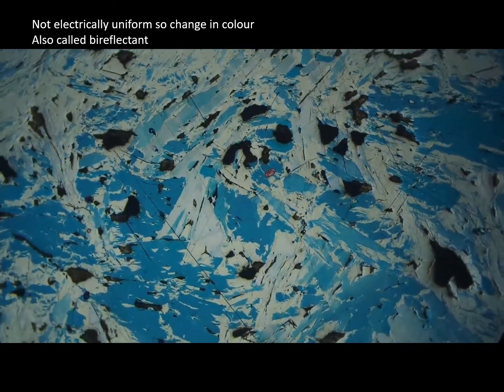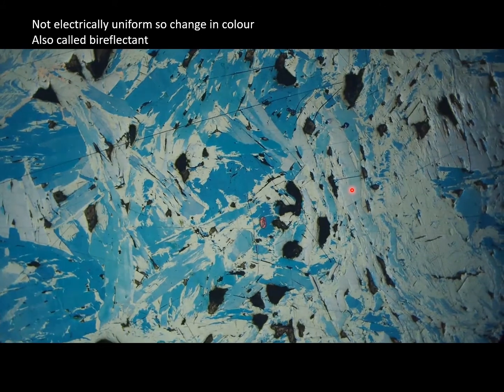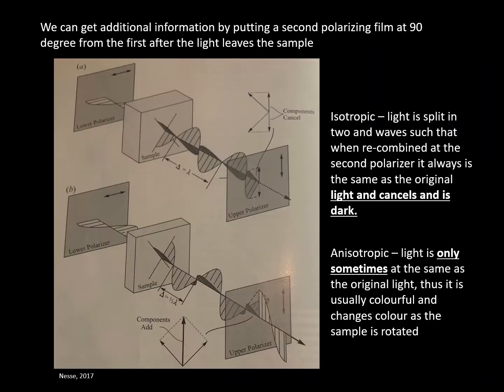And then let's look at this one here. It's now dark blue, and it's going through to lighter blue. This is because we're changing the orientation of the crystal. And because we're changing the orientation, we're changing whether it's the fast wave or the slow wave that is shining through. All right, so we can get additional information in addition to this.